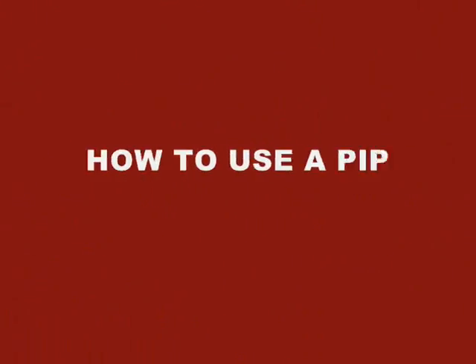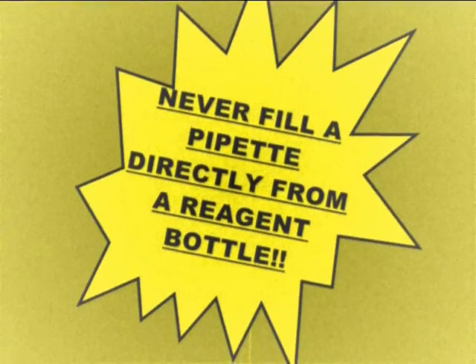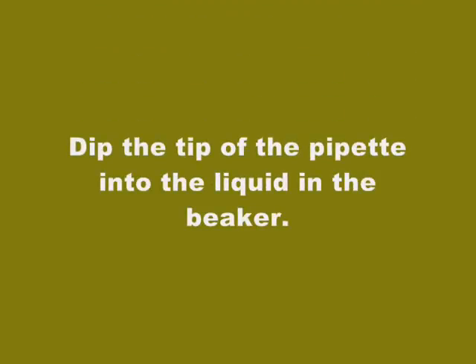How to use pipette. Clean and rinse the pipette with the solution to be transferred. Next, pour the solution more than needed into a clean beaker. Never fill the pipette directly from a reagent bottle. Dip the tip of the pipette into the liquid in the beaker.